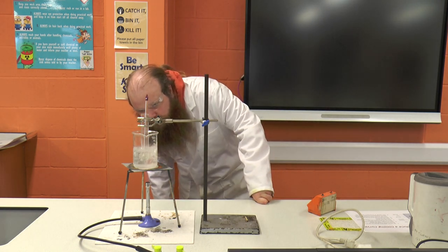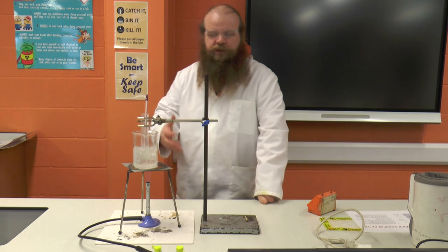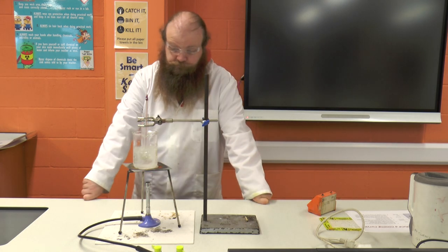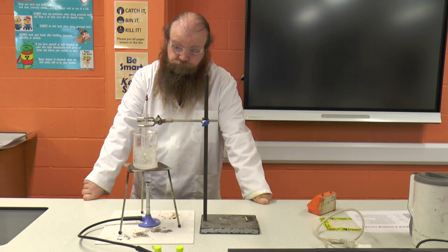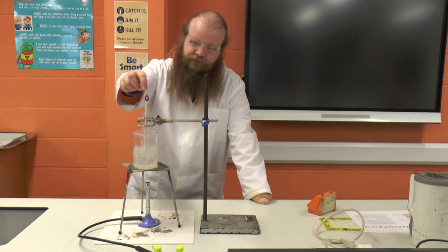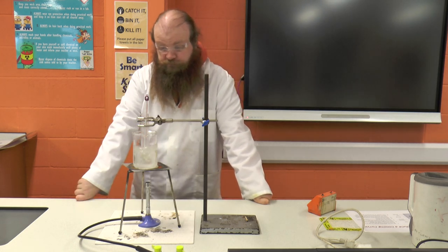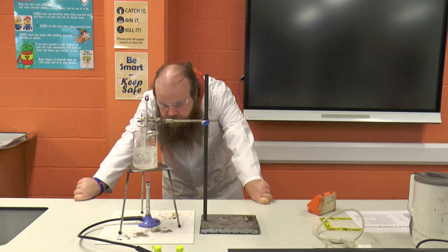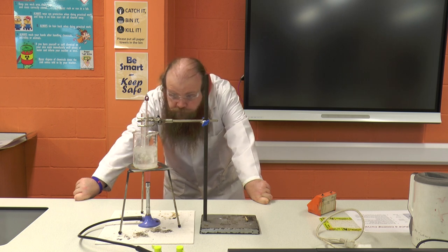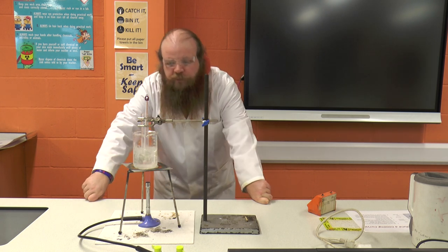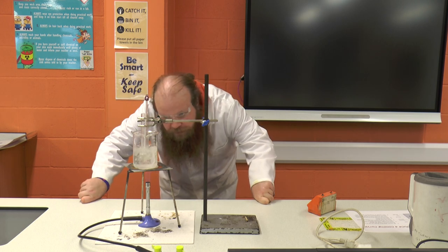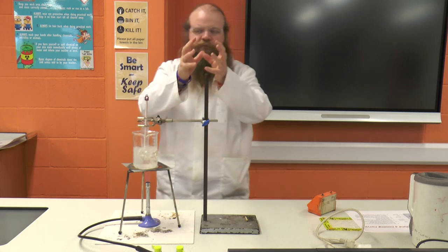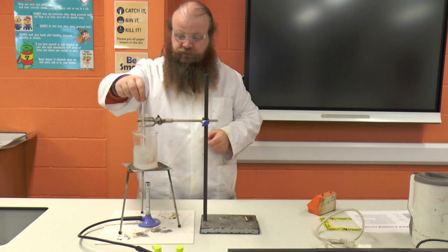We're about three-quarters melted now — it's a fairly quick process. The current temperature of the stearic acid is about 80 degrees. You'll be able to see by looking through the beaker at the boiling tube as the little remaining lump of stearic acid slowly dissolves.